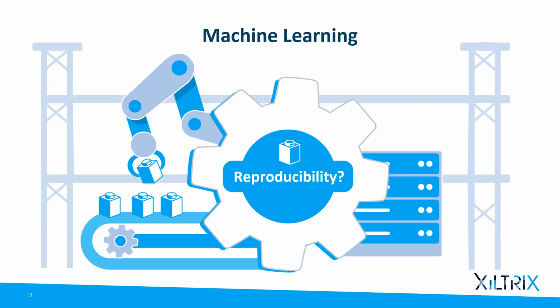So, going back to what we've shown earlier, we need to know as much as possible about how a device is used, by whom it's used, if it was switched on or off. So going back to that metadata and making sure that it can be used in a way that a machine will understand.